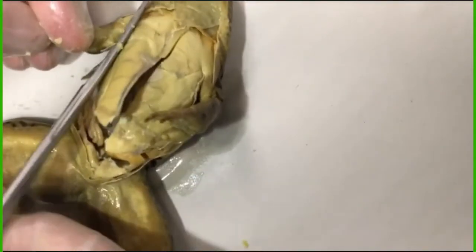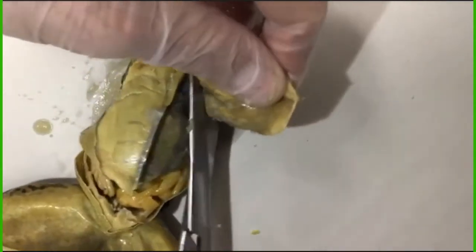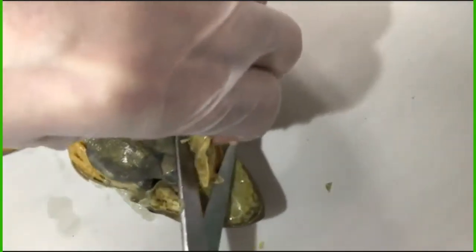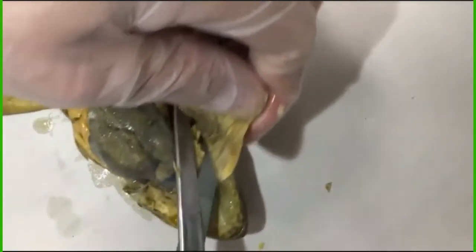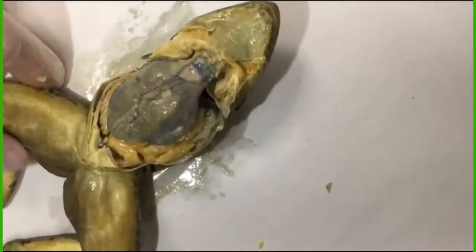Now I'm snipping the arm off because, again, saving time. We don't use dissecting pans in class because it takes too long for the kids to have to wash them. So we're just using newsprint, butcher paper, and laying the frogs on there. And the rigor obviously is set in on these frogs, so the arms are kind of in the way when you're trying to look at the body cavity. So I tend to tell my kids to just snip them unless they feel like they're not in the way. But look at maximum exposure.